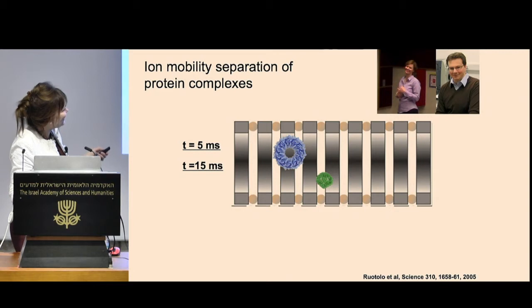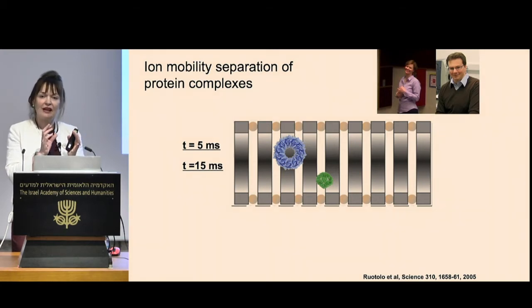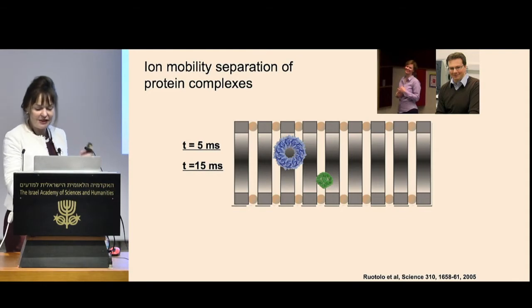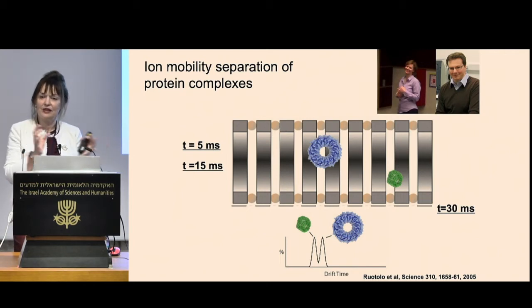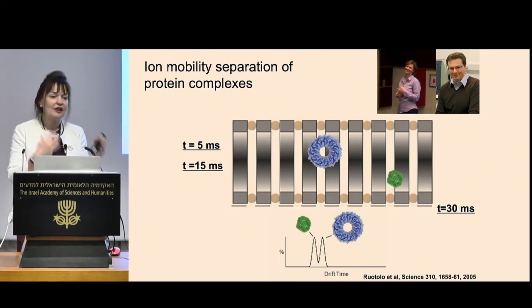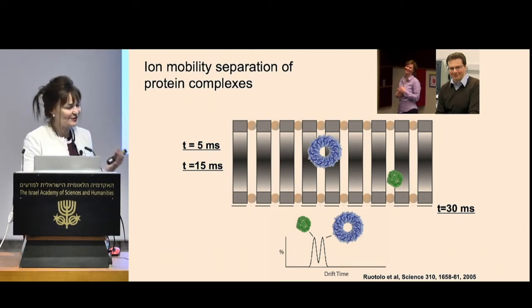The complex that we chose was actually a very fortunate one. It's the trap RNA complex. It's the 11-mer, and it has 2 different conformations, a ball shape and a ring shape. Same mass to charge, readily separated. So we could show that these complexes, if we treated them in a certain way, recapitulated the sort of shapes we would expect. But there was one more thing that sort of haunted me.